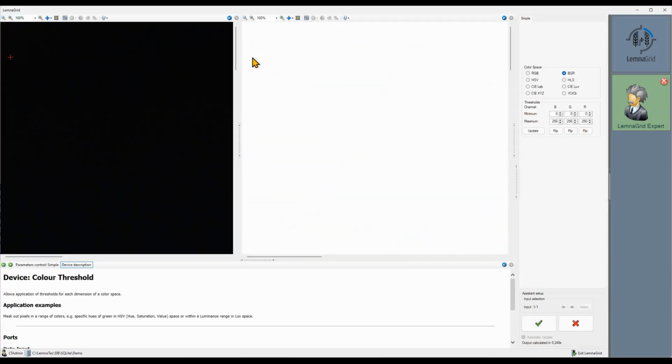With this device, we select all colors within a certain range of values to be the foreground. Foreground is another way of saying these are our objects. You can do this in the normal RGB color space. Let's say all pixels where the red and blue value is smaller than 128, and the green values are greater than 128.